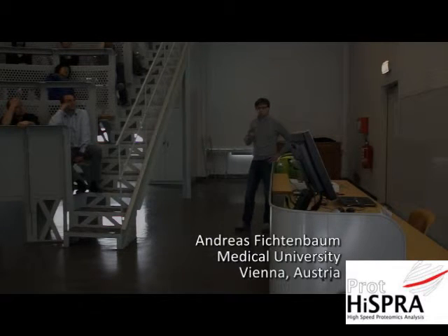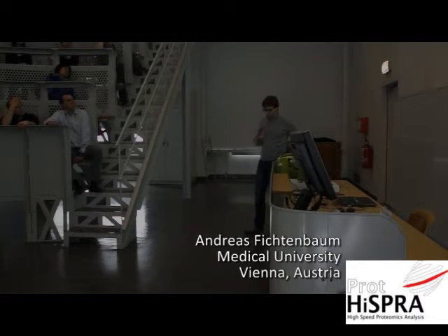If we compare this with the anatase titanium dioxide column, surprisingly there was no difference to the blank one. And compared to the column containing rutile nanoparticles, there was a huge improvement, so much more phosphopeptides could be identified from the elution fraction of this column.